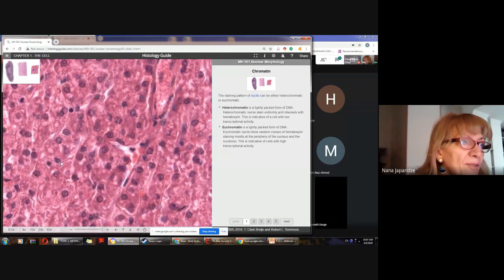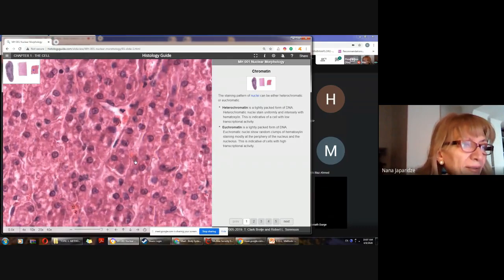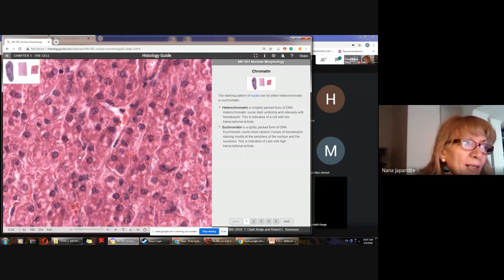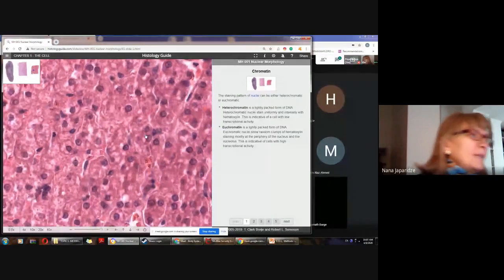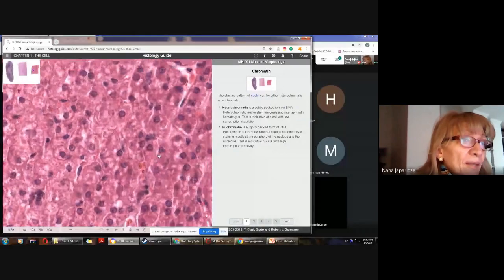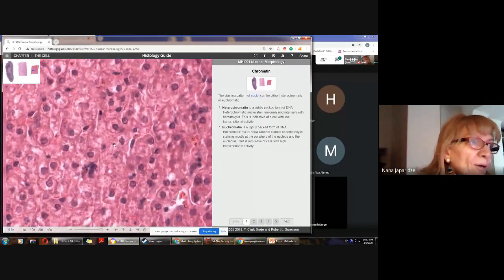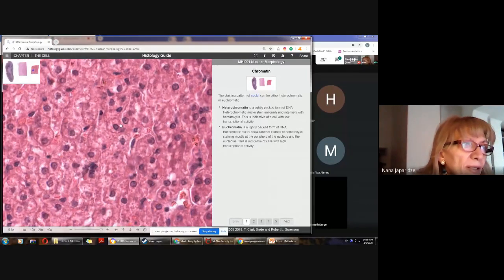This is tissue. Look, capillary. Capillary is here, and in this capillary you can see only one RBC. Usually the diameter of capillary fits the size of the RBC, because RBC should move through this lumen of capillary. Of course, this is lumen of the capillary. Okay, hopefully you see here the nucleus very well.